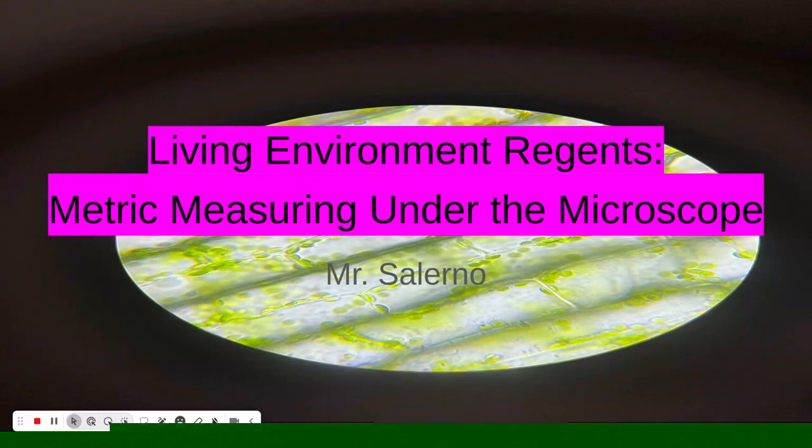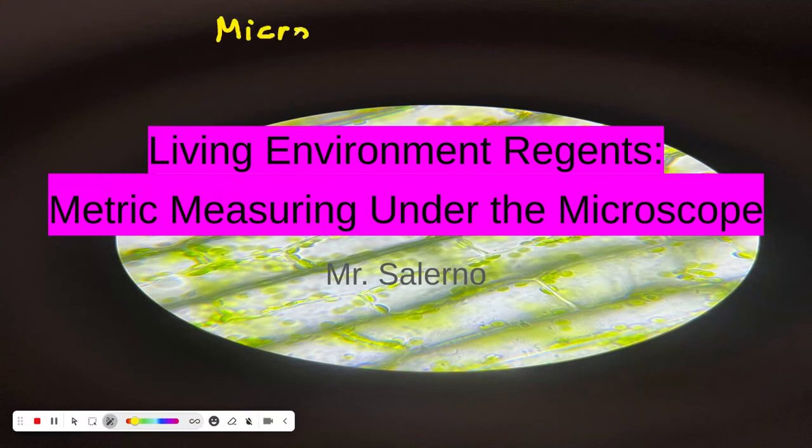today. So we're going to be talking about measurements in the micrometers. Micrometers. And there's a special symbol. It's a Greek letter mu with that M. And that's mu without two O's. It's just mu. Mu. Micrometers.